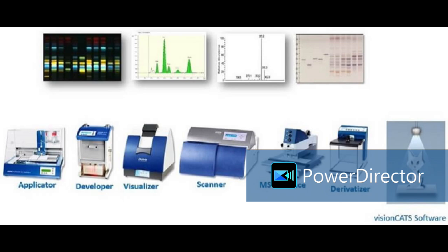See here, THC, tetrahydrocannabinol, is not visible here under 254 nanometer light, but after scanning the plate under 210 nanometer, you can see the peak response here. This bigger peak is because of this band at 0.3 RF value, but 0.3 के आगे 0.4 पे जो बैंड यहाँ है, it is not visible under 254. But after scanning the plate, इसको स्कैन किया 210 नैनोमीटर में, you can see the peak response.